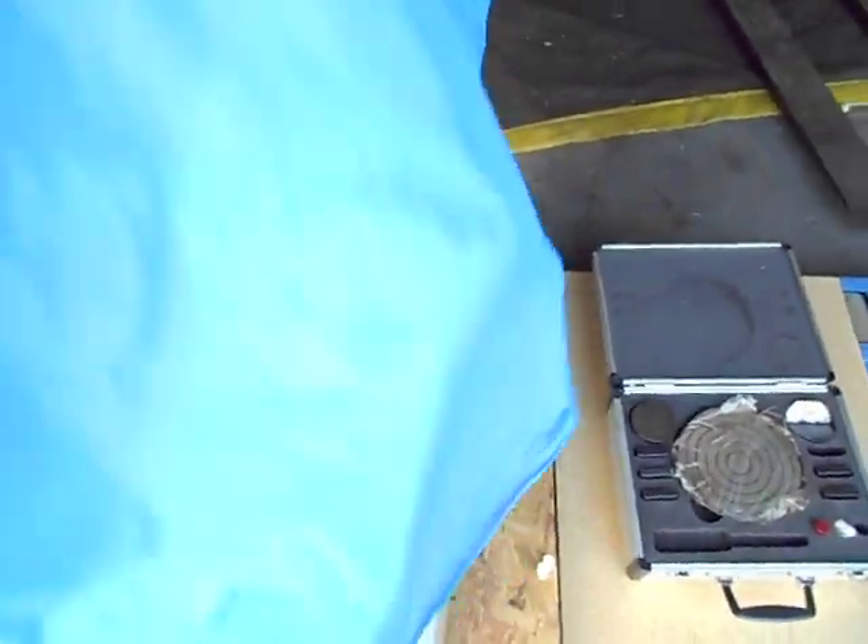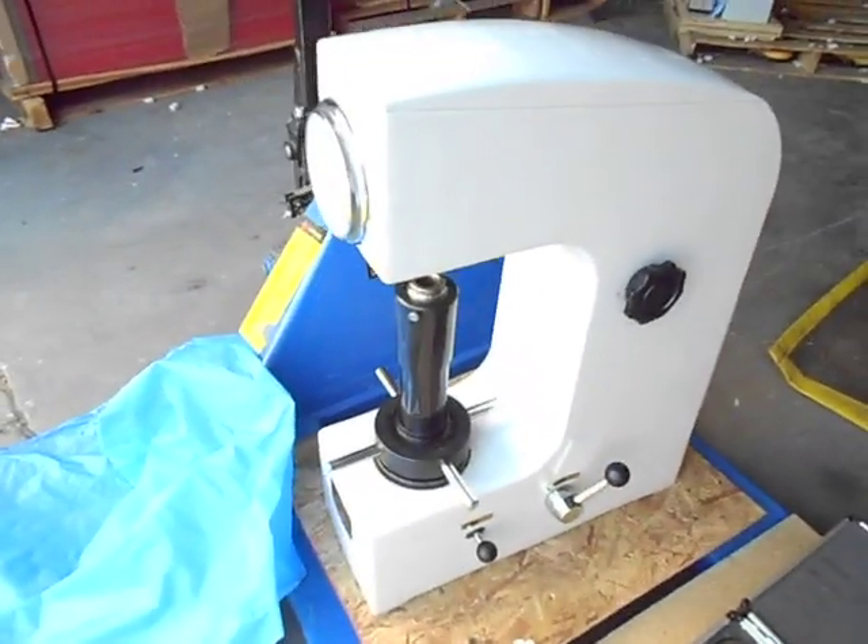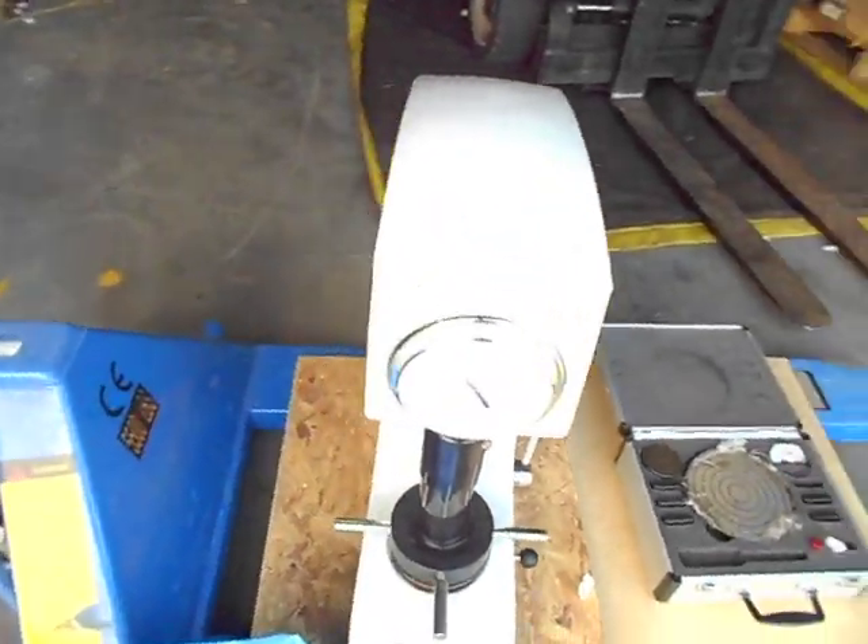Thank you for choosing industryrecycles.com. Here today we have a Rockwell hardness tester. You'll see all the rest of the specifications in the listing.